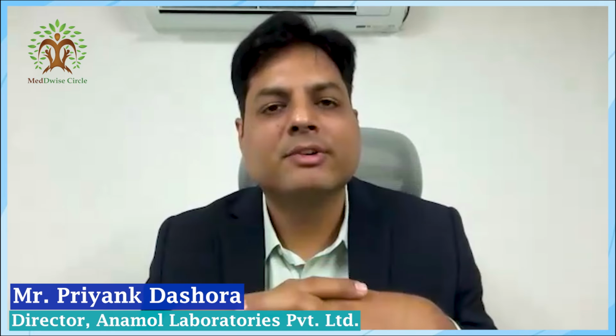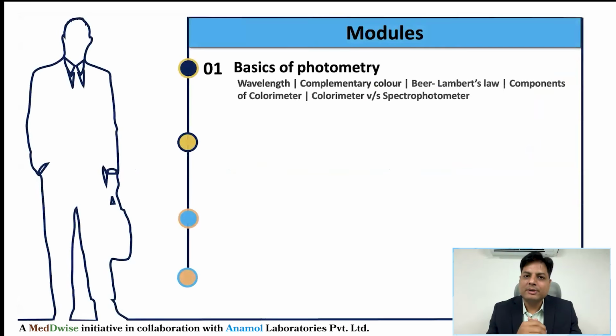So in this video series, we are going to talk about the fundamentals of clinical chemistry tests, which are majorly used in the pathology lab. This video series focuses on 4 different modules, out of which the first module only covers the basics of photometry. In this, we are going to cover various topics, for example, what is wavelength, what are complementary colors, what is Beer-Lambert's law, what are the components of a colorimeter, and what is the difference between a colorimeter and a spectrophotometer.